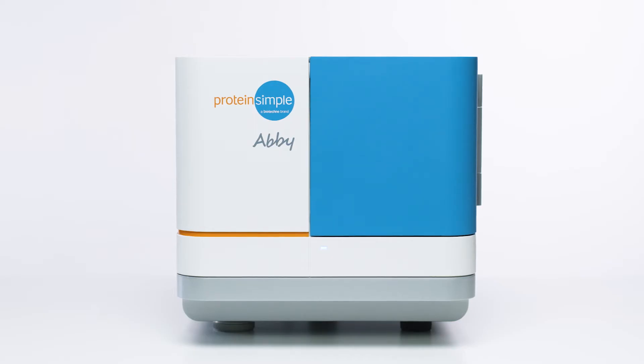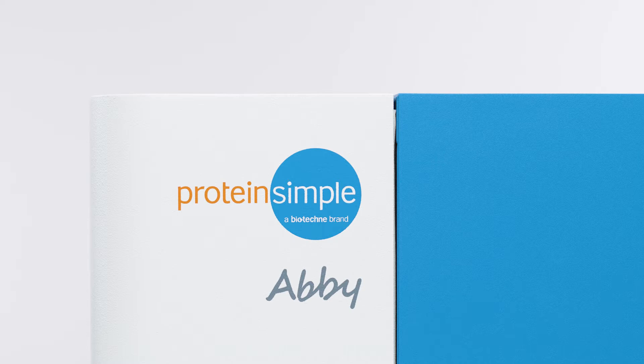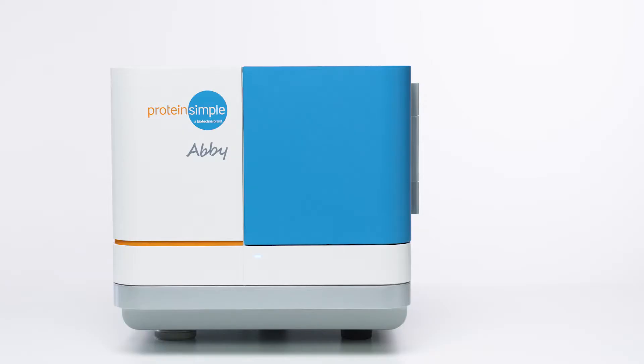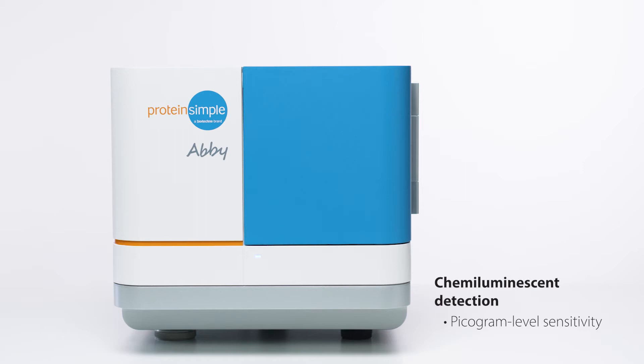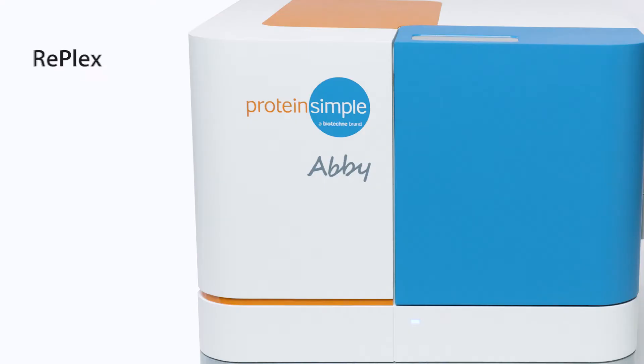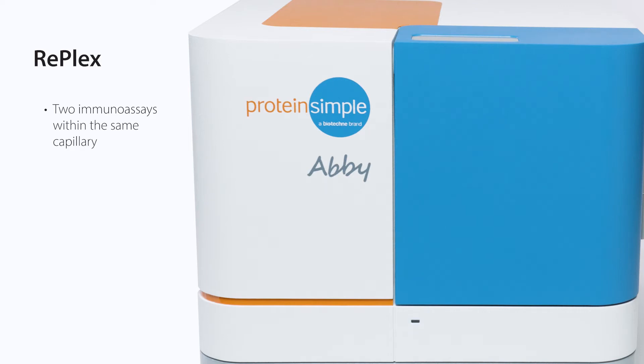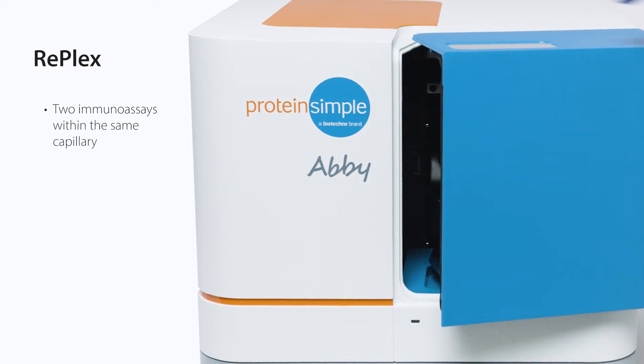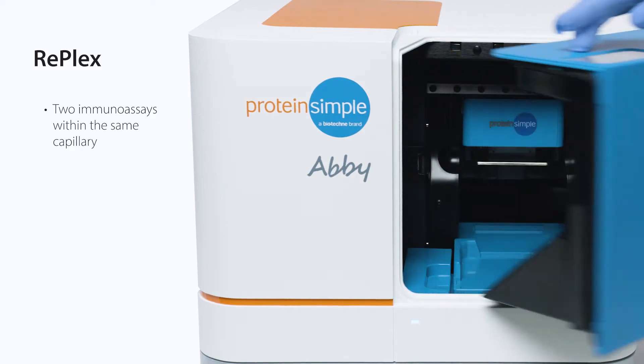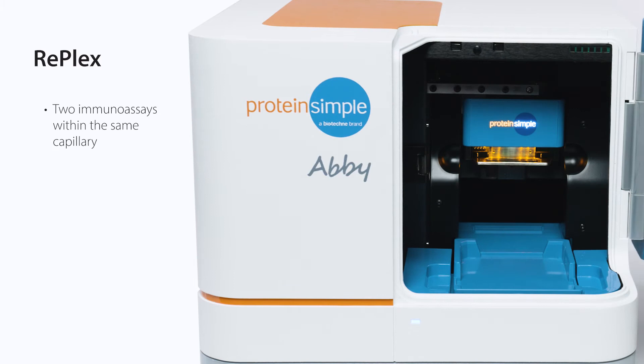With Abby, you can even run two immunoassays in the same capillary using the RePlex module. Abby's chemiluminescent detection provides picogram-level sensitivity. And with the new RePlex feature on Abby, you can run two immunoassays within the same capillary to get more protein characterization data from one sample.